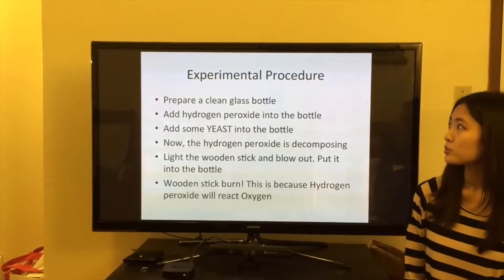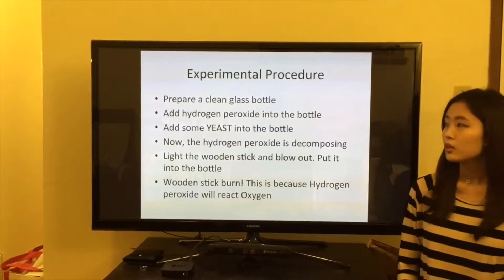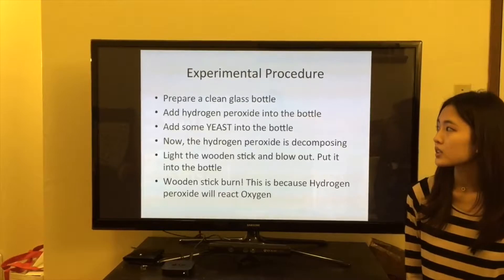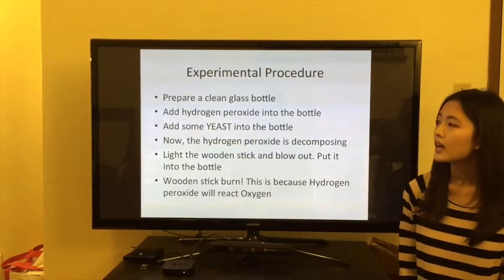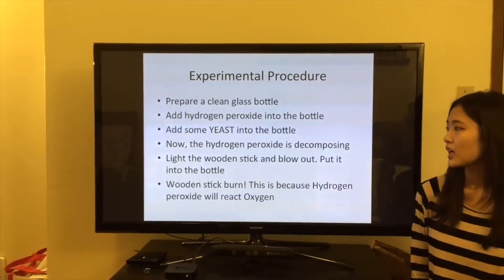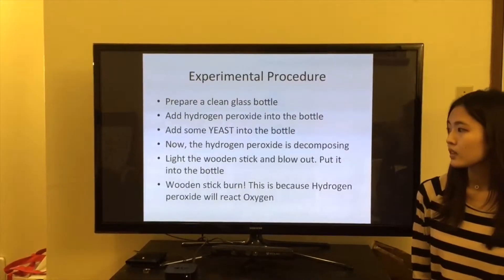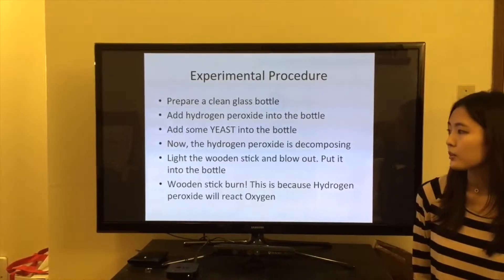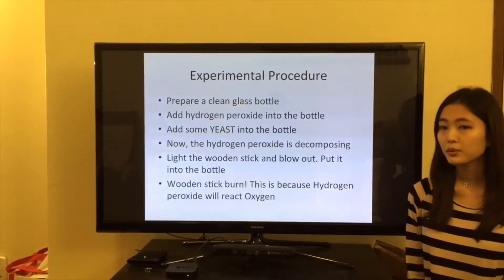The experimental procedures are: prepare a clean glass bottle, add hydrogen peroxide into the bottle, add some yeast into the bottle. Now the hydrogen peroxide is decomposing. Light the wooden stick and blow it out, then put it into the bottle. The wooden stick burns.